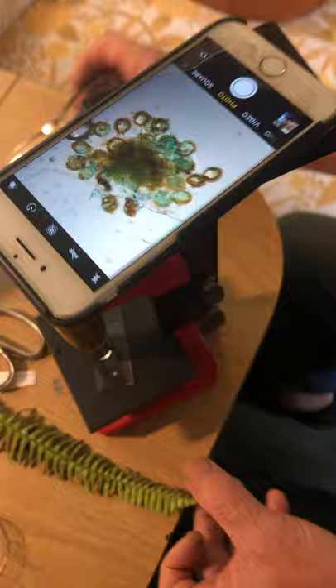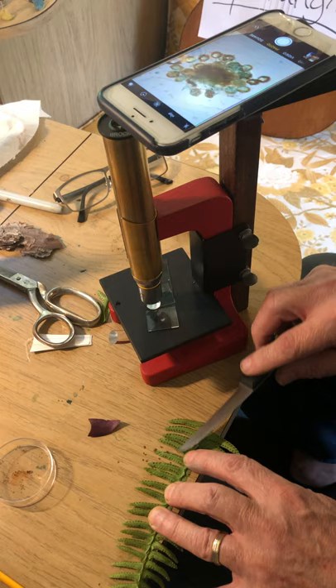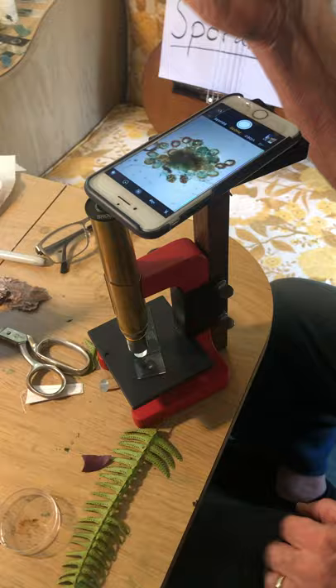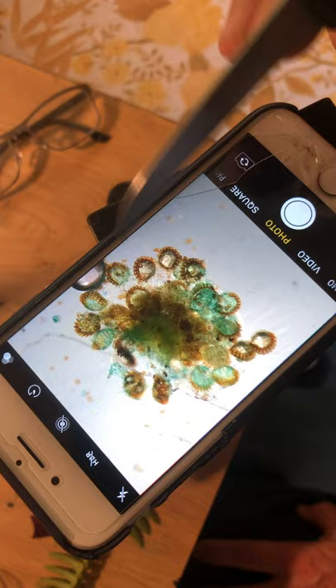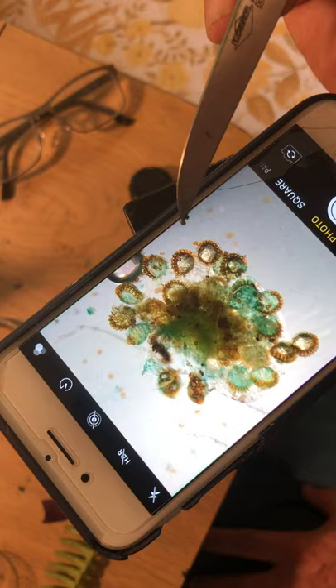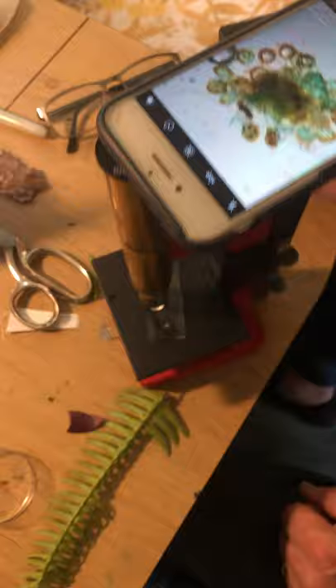I took a knife — let's just focus on this a second. These have all been opened and they're all gone; they disappeared during the night, they all came out. Let's go to the screen. You see these little circles here and here and here? Those are little spring-loaded capsules, and in each one of these is dozens of spores — 64 is one number I saw quoted. 64 spores inside there, and the spores are these little tiny things you see scattered about.